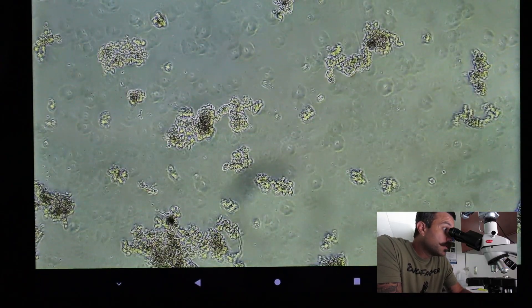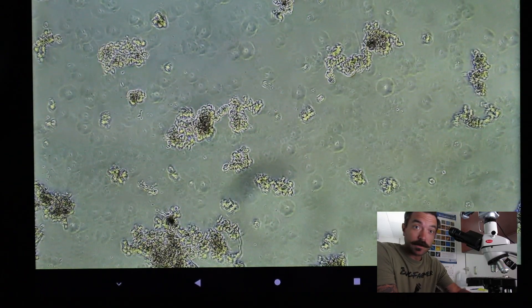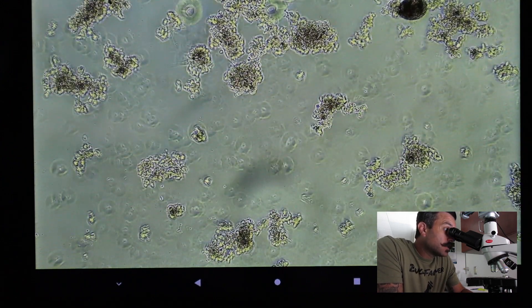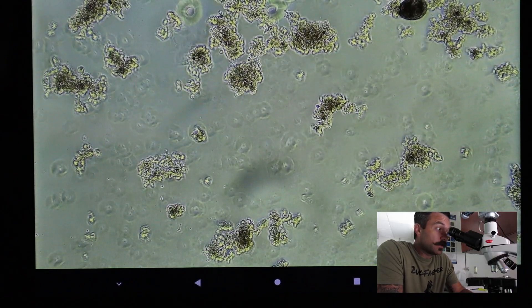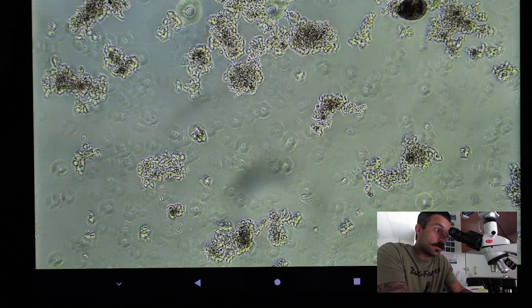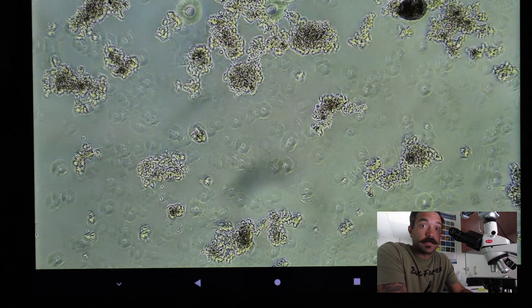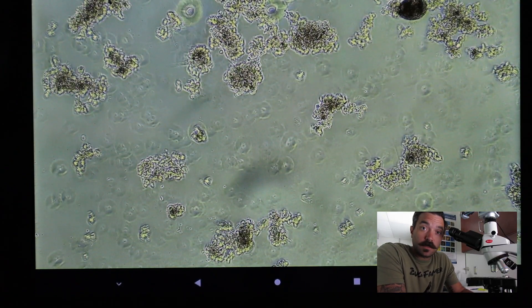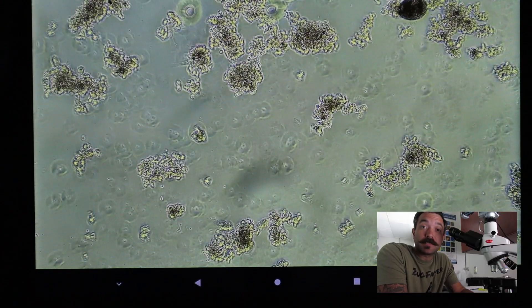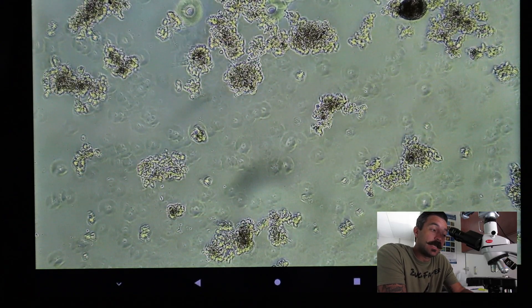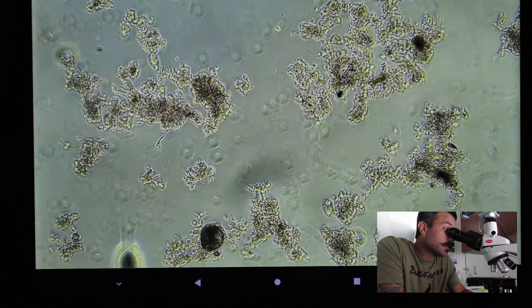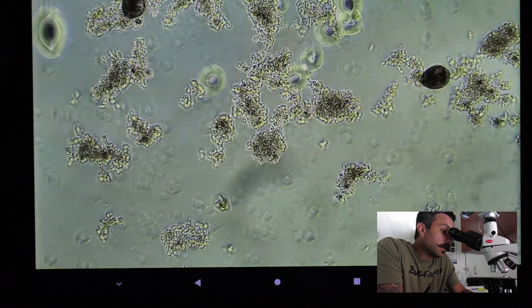Here we are underneath the microscope. This is an activated sludge process - the activated sludge part means living. There are microorganisms, bacteria, consuming that wastewater. The way we can see what the bacteria is doing is by studying these microorganisms, knowing their life phases and their processes. We're going to start scrolling up the slide.